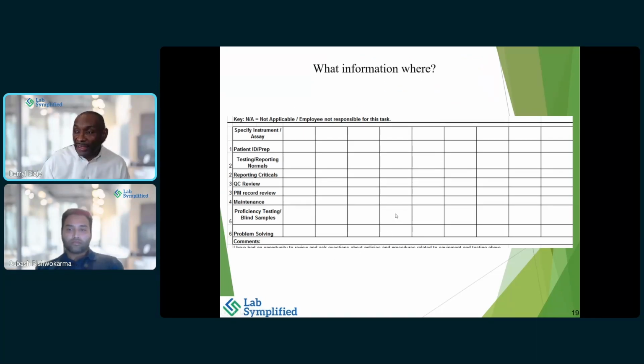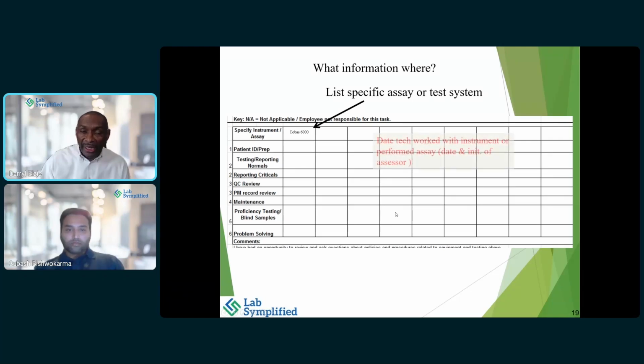And when we're going through this by competency, we're going to have a discussion. Especially if I see blank spaces, you need to have an explanation right there. I recommend definitely don't have any blank space, but also have an explanation on an NA, because I will ask, well, you put NA here, why is that NA? You should be ready for that question.